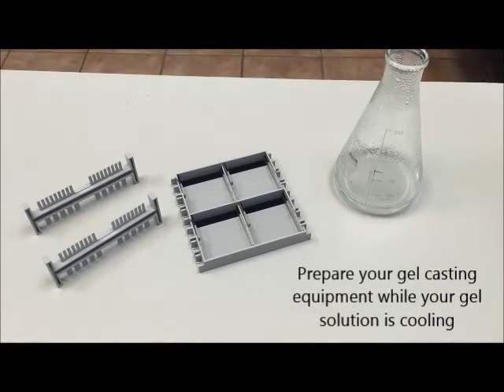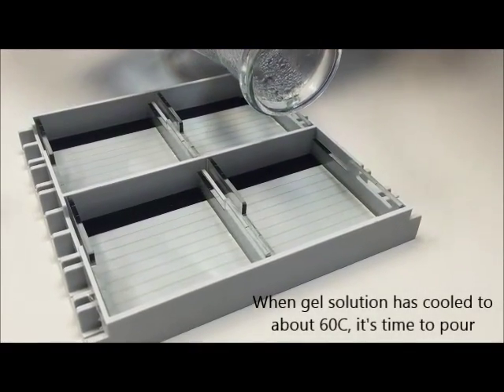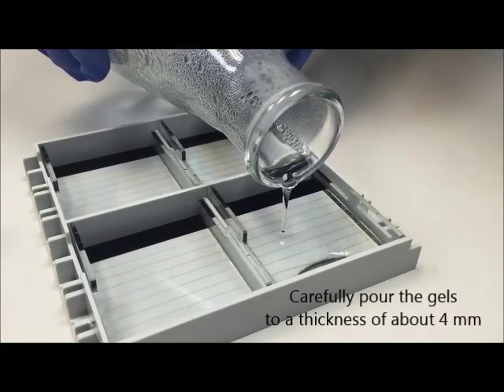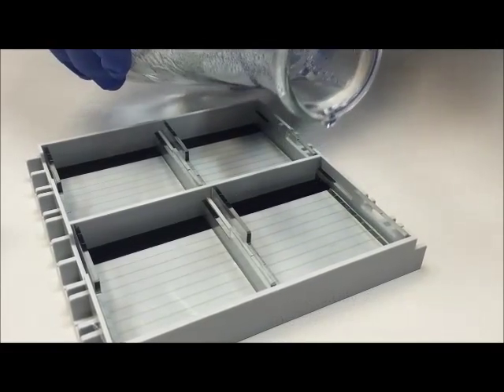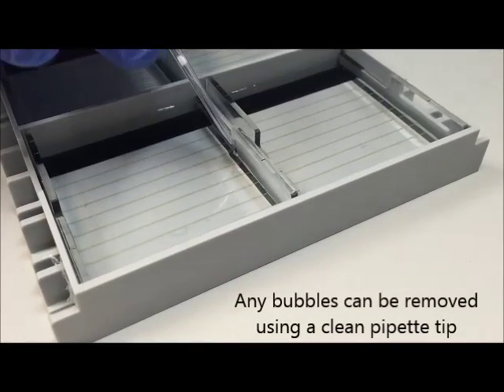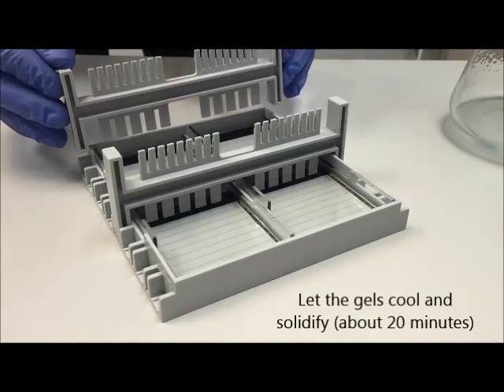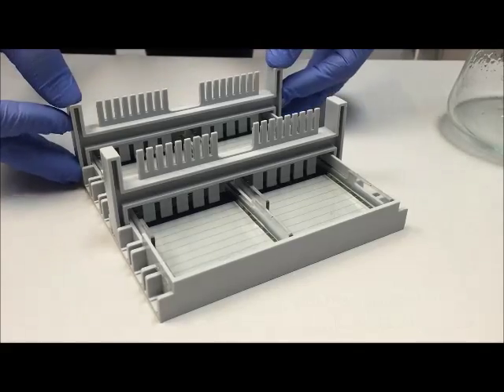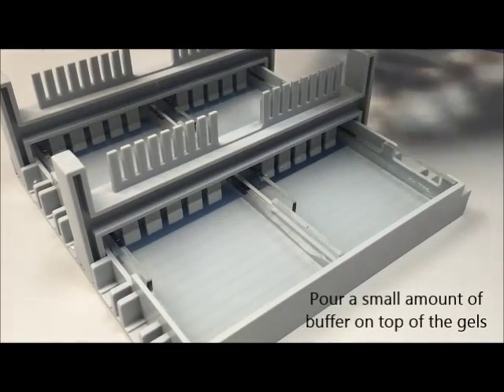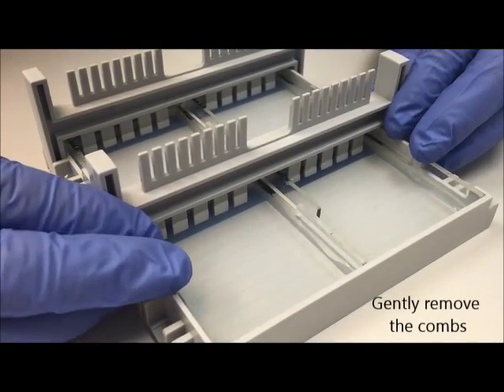The next step is to prepare your gel casting equipment. We're using the Acuras MiGel casting set that comes with the MiGel system. It's important to let your gel solution cool to about 60 degrees before pouring, otherwise you can warp the gel trays. Carefully pour the gels to a thickness of about 4 mm, trying to prevent any bubbles from forming. Any bubbles that do form can be removed quickly with a pipette tip. Put your combs into place and let the gel cool for about 20 minutes. Once the gels have solidified, pour a small amount of buffer on top to facilitate removal of the combs, then gently pull the combs straight up and out of the gel, being careful not to tear them.